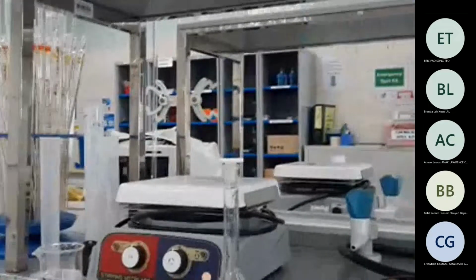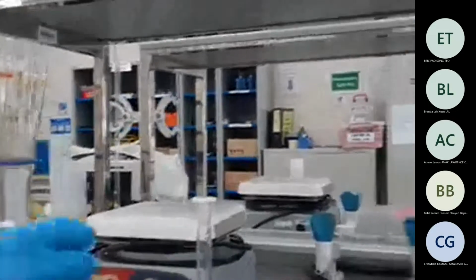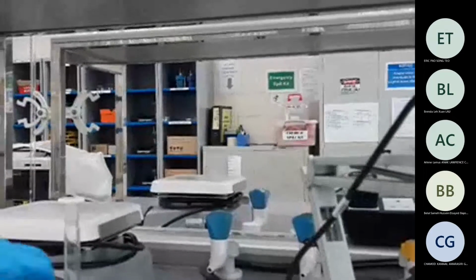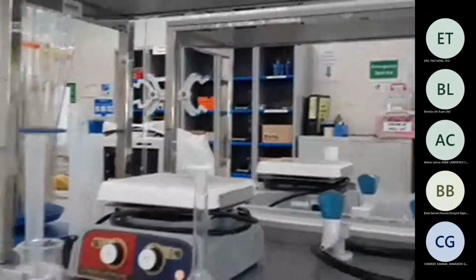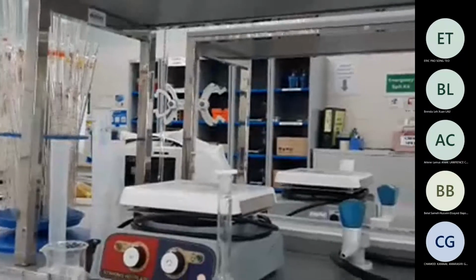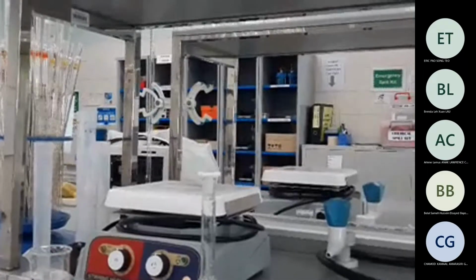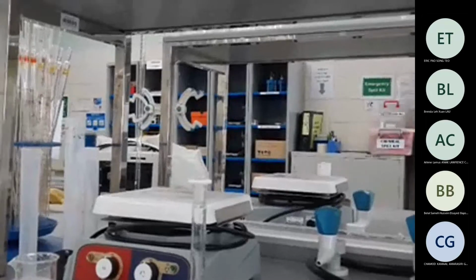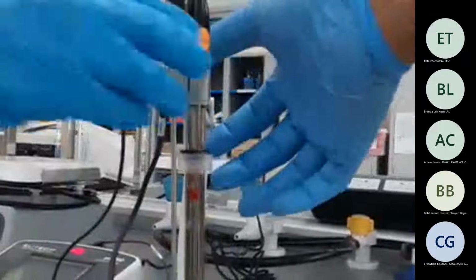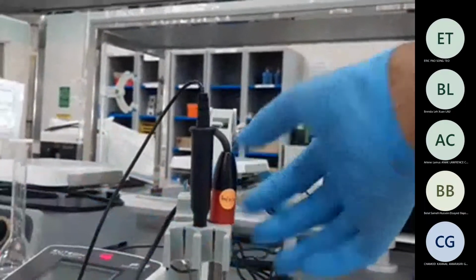Put it there. All right, and then take around 50 to 60 milliliters so that our probe will be dipped inside. Okay, good. Press gently so that both probes go down.